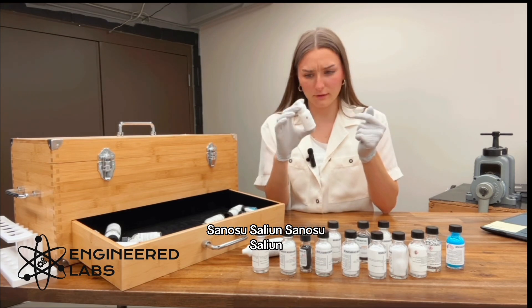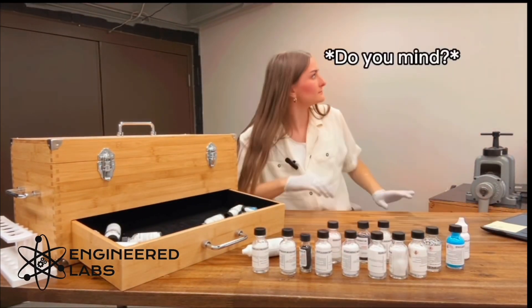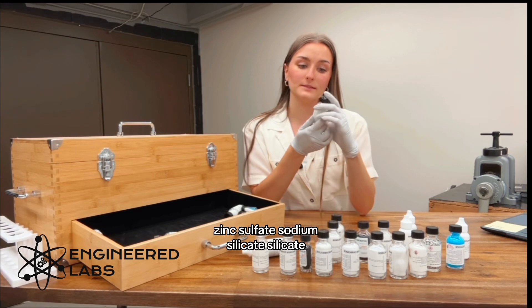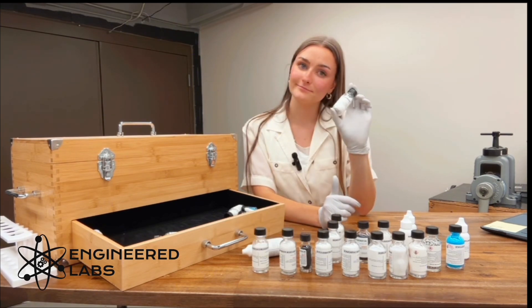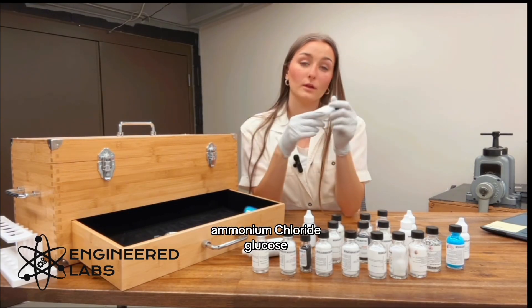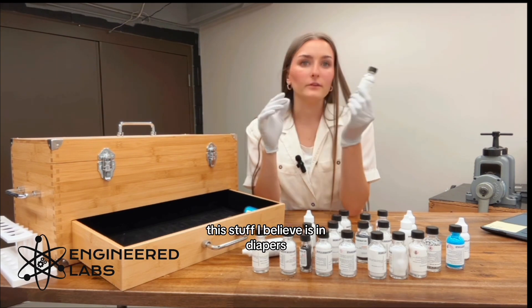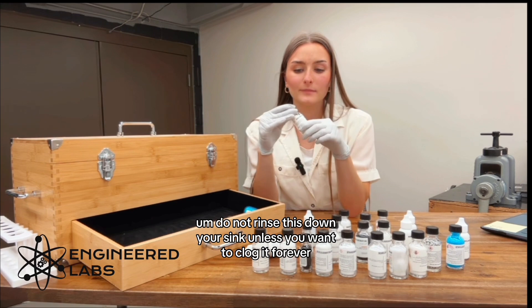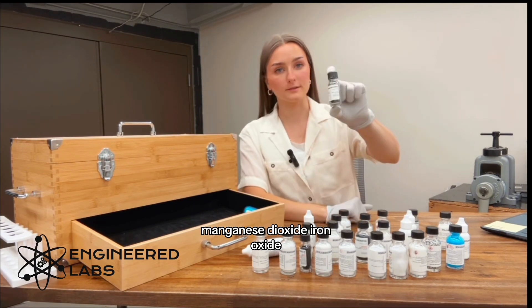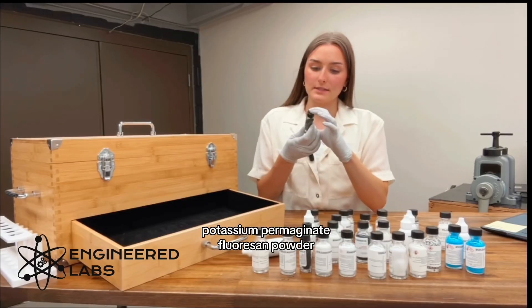Phenolphthalein, glycerin, universal indicator, zinc sulfate, sodium silicate, methylene blue, ammonium chloride, glucose, potassium sodium tartrate, sodium polyacrylate — this stuff I believe is in diapers, and do not rinse this down your sink unless you want to clog it forever — manganese dioxide, iron oxide, manganese sulfate, iron, and potassium permanganate.